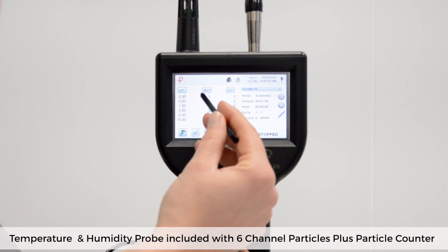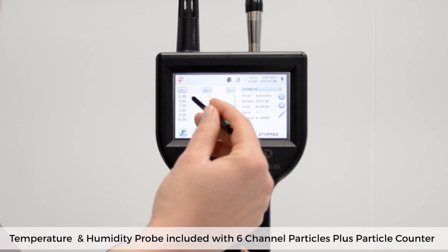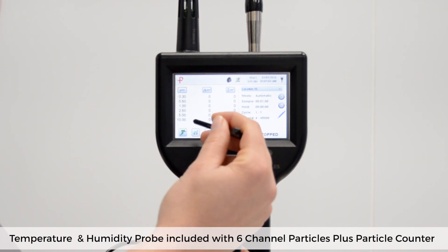The particle sizes the unit will measure are shown on the home screen. This is a six channel unit so there are six rows here ranging from 0.3 micron to 10 micron. These are shown in the first column.